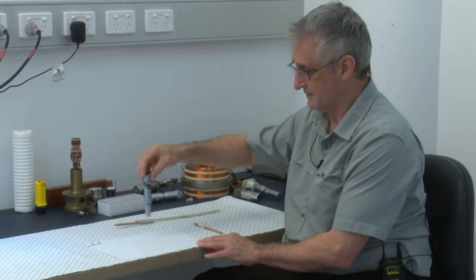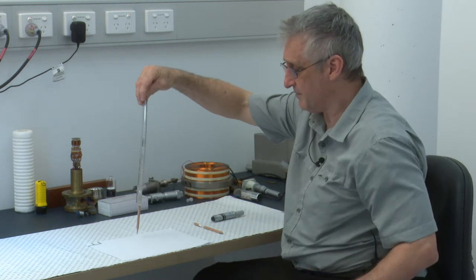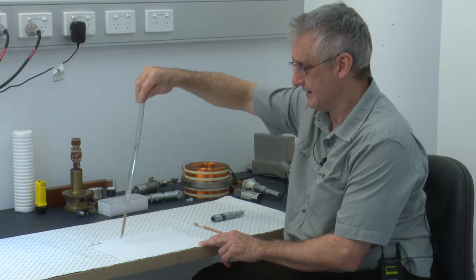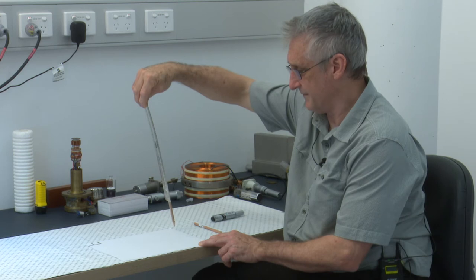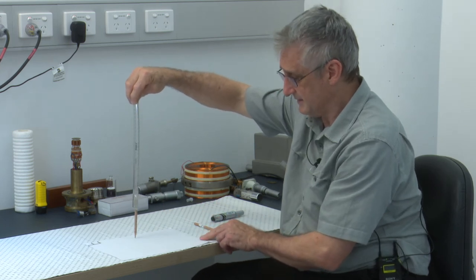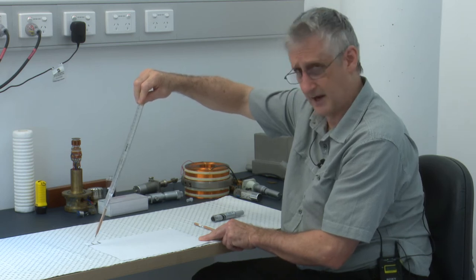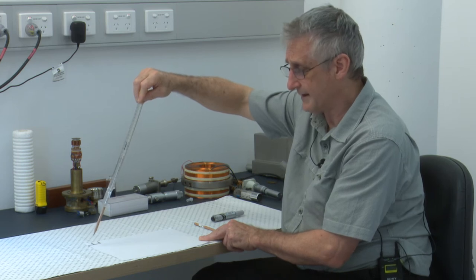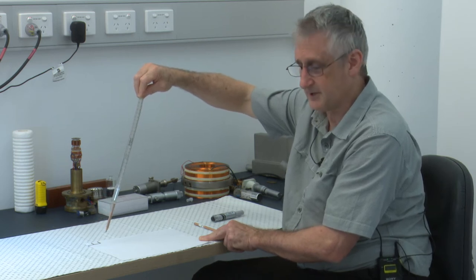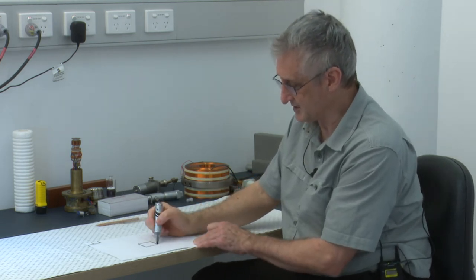We talked before about the beam being positioned at each of the pixel points. We can think of the beam in this way. It is deflected by the electromagnets to the edge of the scan and through the center to the other edge of the scan. At low magnification, that distance is quite large. That means that the length of the beam in the center versus the length of the beam at the extremities of that low magnification scan are quite different. And that can introduce sine theta errors and some distortion at low magnifications, perhaps less than 500 times. At high magnification, as you know, we are only scanning a small area.